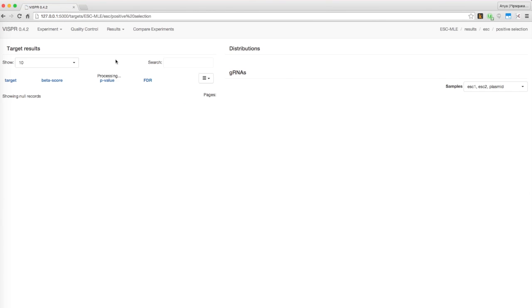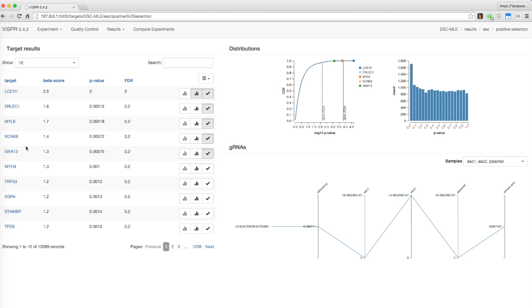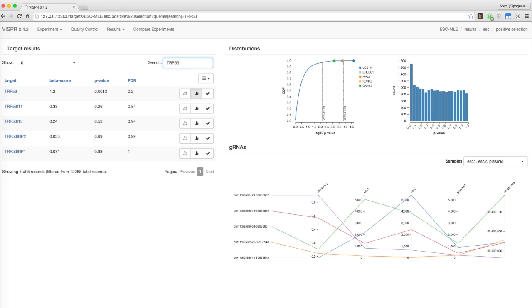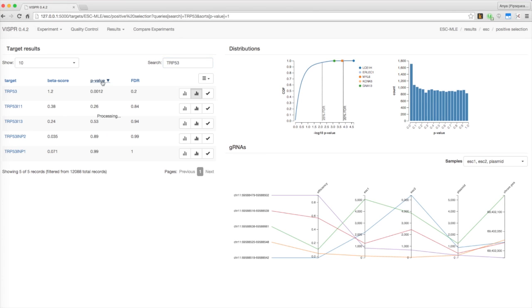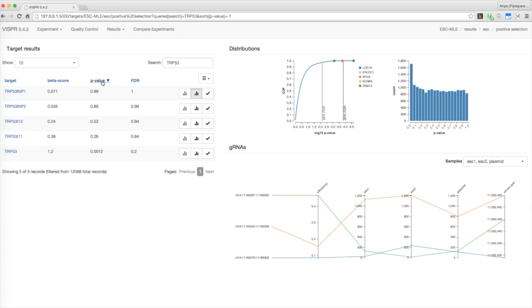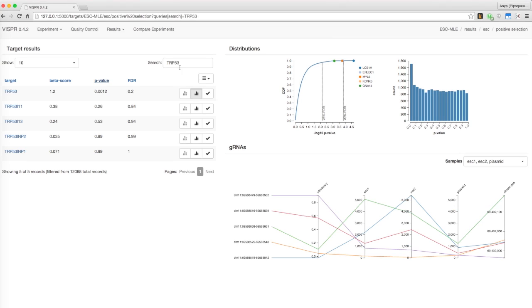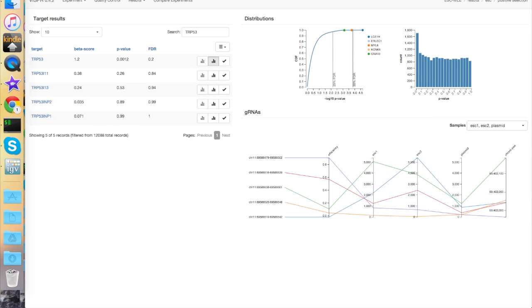The first thing you'll see is a table displaying the comparison results of each gene. You can filter the results by entering expressions into the search box. The results can also be sorted forwards and backwards by clicking on the appropriate column. The table can be easily downloaded from the menu as a tab-delimited text file.